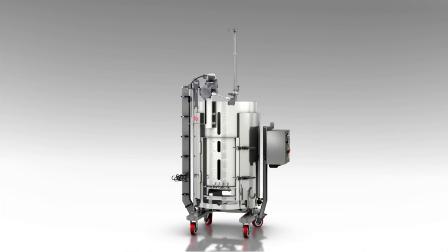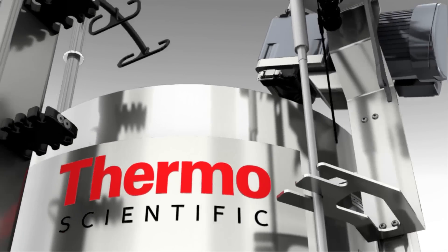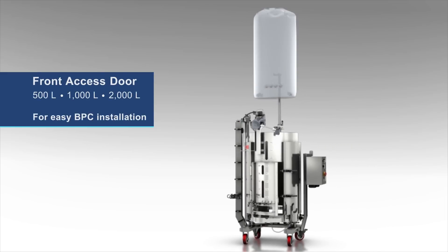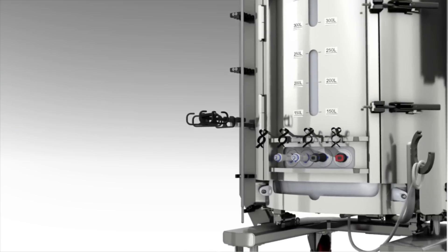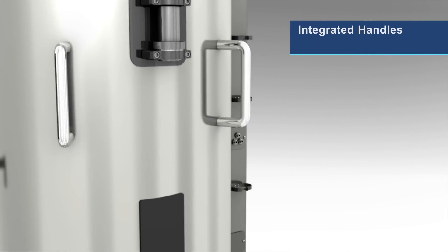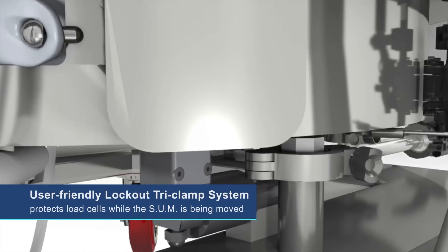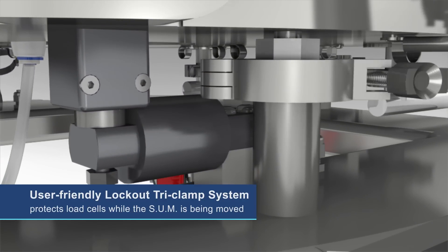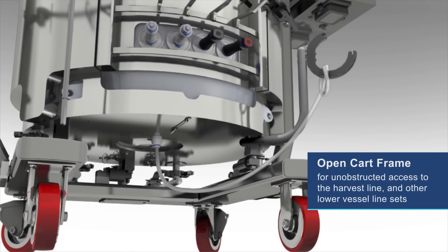Key features include a cable management tree for organization of process lines, upgraded surface finish for improved cleanability, a front access door on the 500, 1000, and 2000 liter units for easy BPC installation, BPC tab holders for correct BPC positioning, integrated handles for system mobility, site windows and level indicators for viewing batch liquid levels, a user-friendly lockout tri-clamp system that protects load cells while the SUM is being moved, and an open cart frame for unobstructed access to the harvest line and other lower vessel line sets.